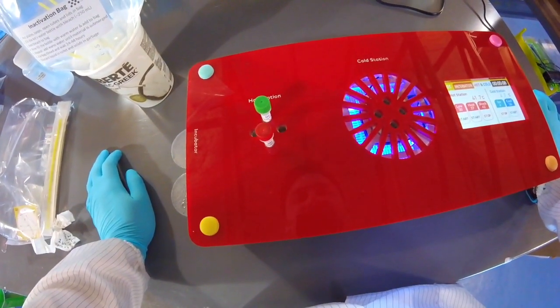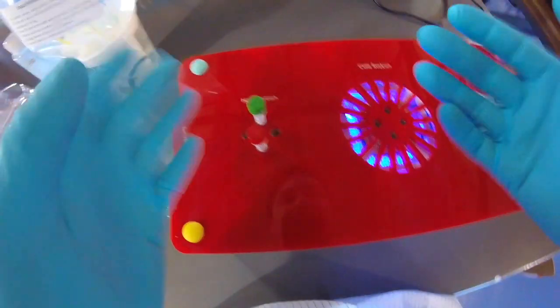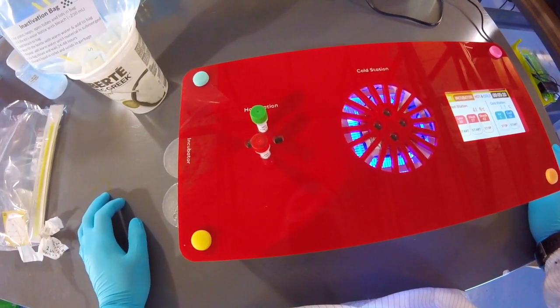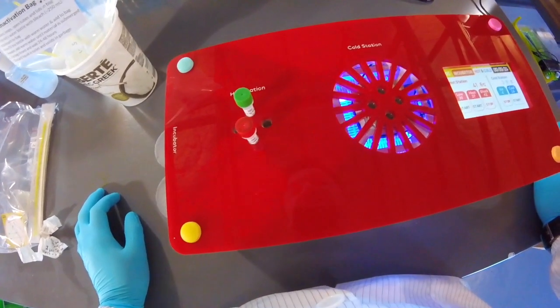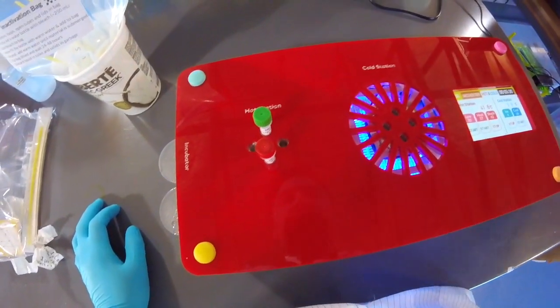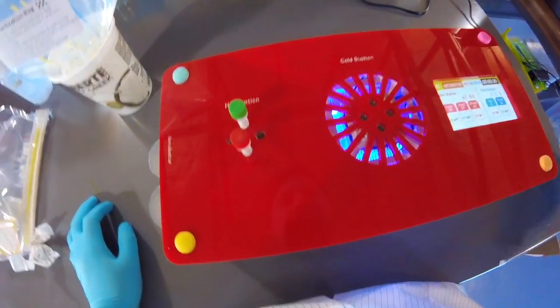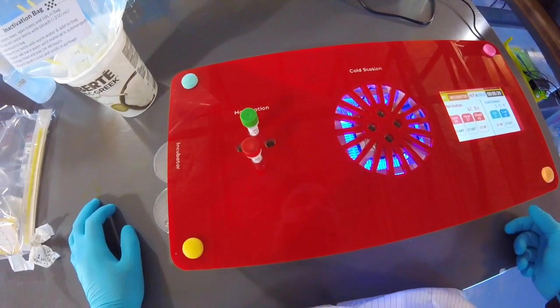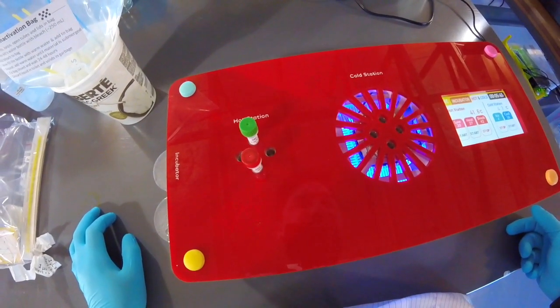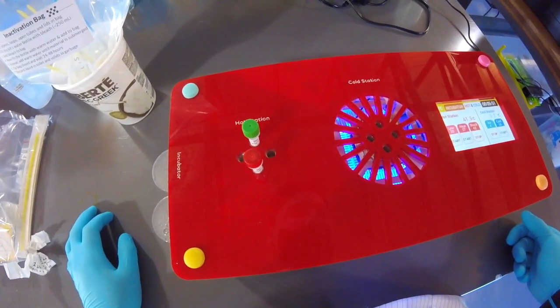And so again, right now the cells are warming up. The membranes, which are made primarily of lipids, are kind of vibrating more. They're becoming more quote-unquote liquid, and so that again makes the membrane more fluid and permeable to things in the outside environment. So right now maybe the calcium is coming in due to diffusion. You might have learned about diffusion, from high concentration to low in the cell, which might be pulling the plasmids into the cells. Funny enough, the exact mechanism behind this transformation isn't very well understood. So there are a number of hypotheses that are still out there.